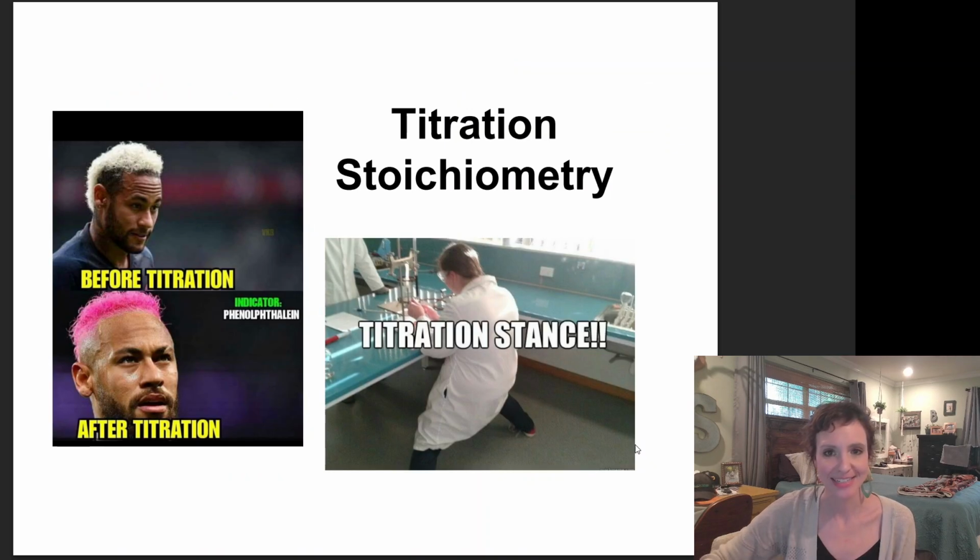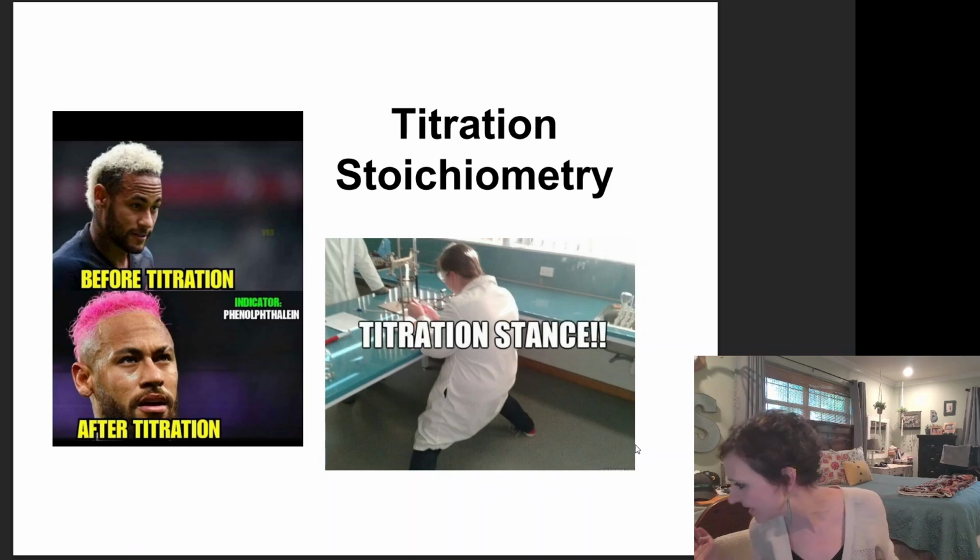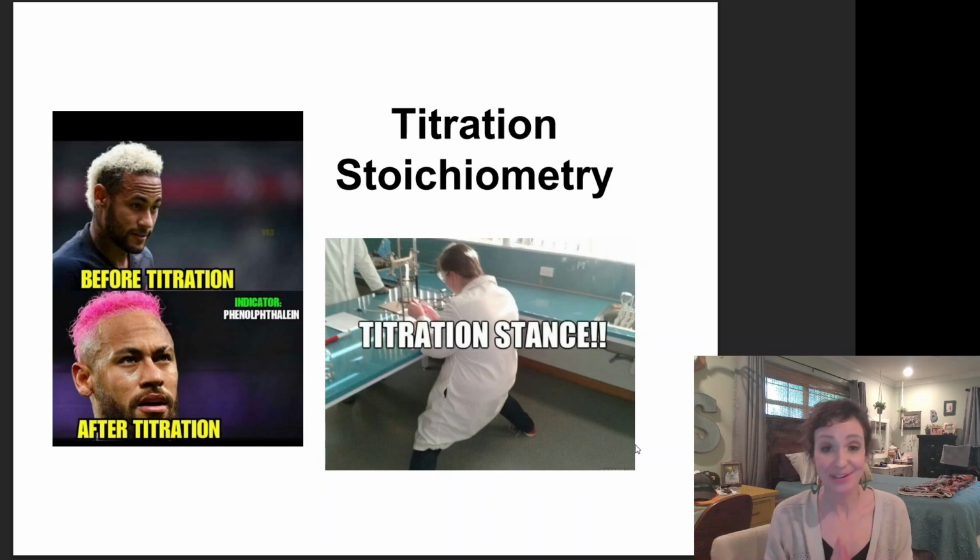Amazing. Okay, titration stoichiometry. You were telling me that we're doing all this dropping things into things, and then we're going to have to do some calculations with that. And you're like, oh, it's stoichiometry, you guys, okay? We're just doing a lab technique to use stoichiometry to calculate the unknown of our analyte. Let's look at what this really is going to look like for us.